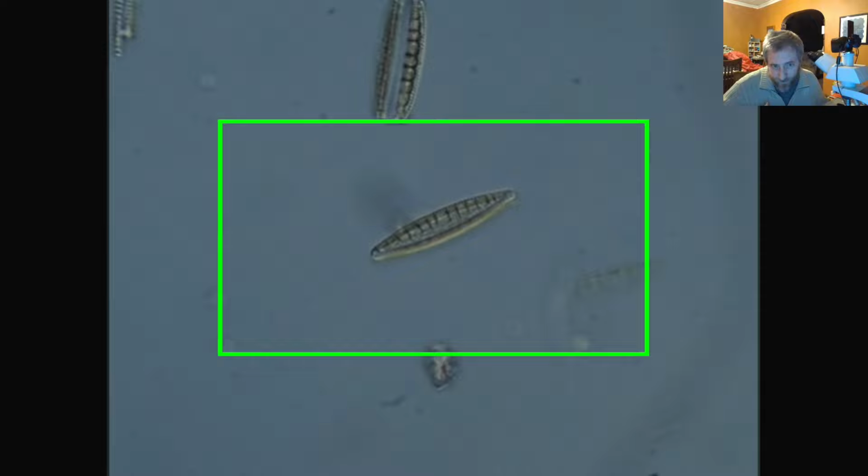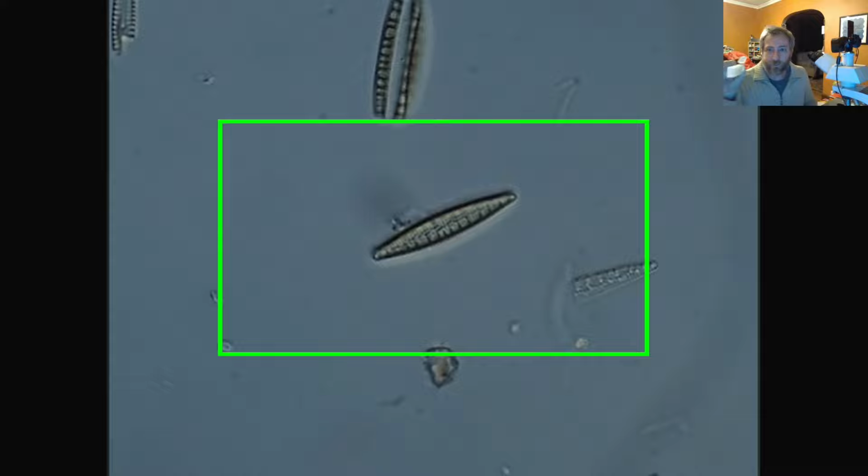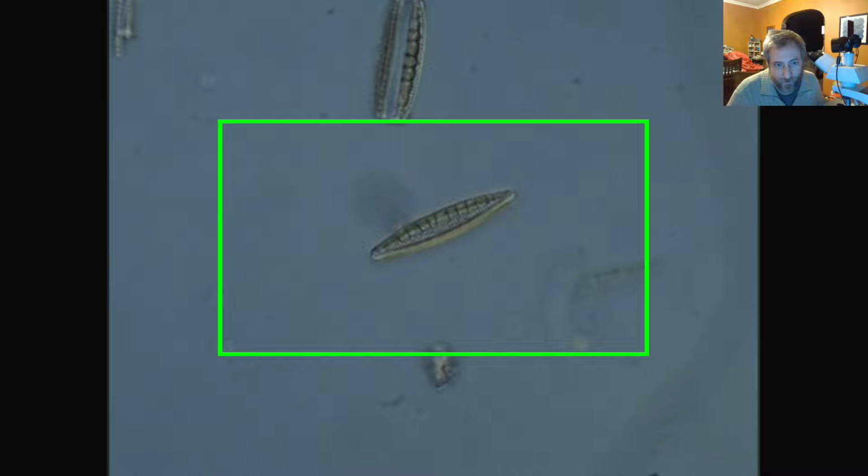We can only see stuff in one plane at a time. But if I change the focus as we move through the diatom valve, there's the bottom ones, and then there's the top valve. And you can see that you have two different valves. So like our box, we're looking at it from the side, but here we're looking at it from the top. We focus on this plane, and then we can focus through the diatom, and now we're focused on the top plane, right? What we see is that those little bubbles switch sides. They go from that side to this side.